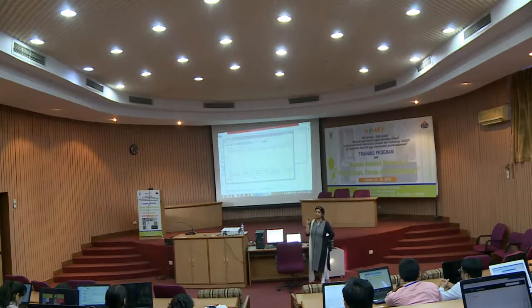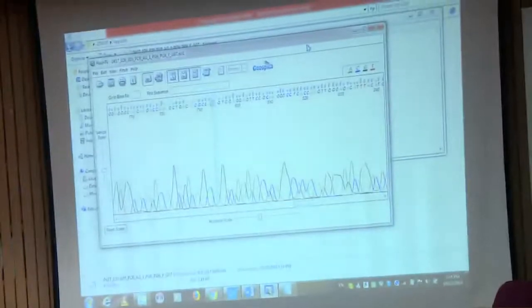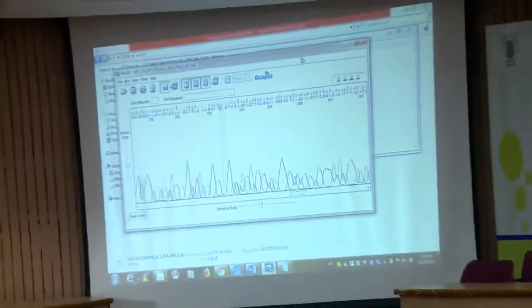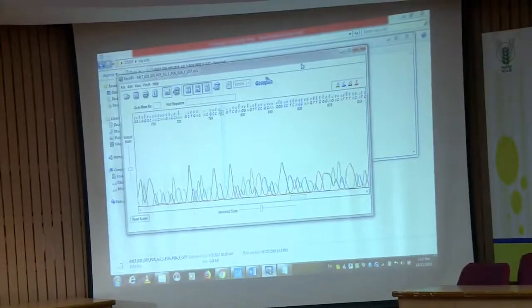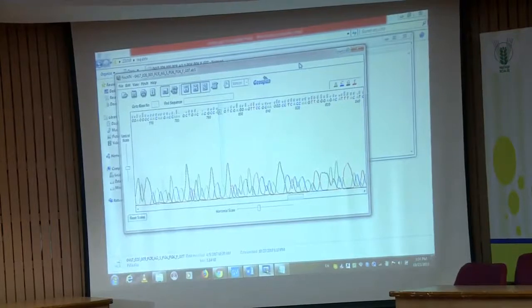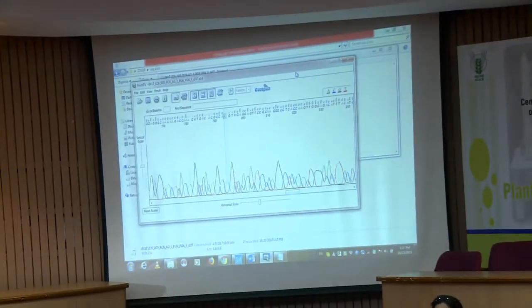Whenever you get the data, the very first thing is to open the chromatogram, check the graph, check these peaks. If these are good peaks, then please take it further, otherwise just dump it into the dustbin. That is of no use. Don't go with the FASTA files only, that okay, ACGTs, they will give you something, but don't go with that, right. So now the second part is you got both the data, from the forward and reverse.